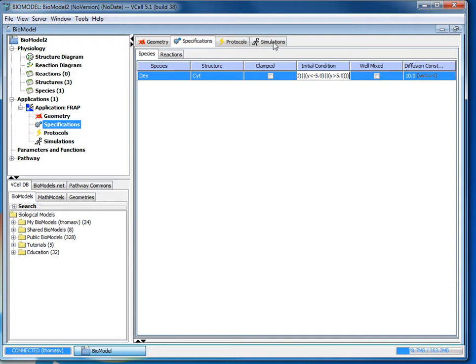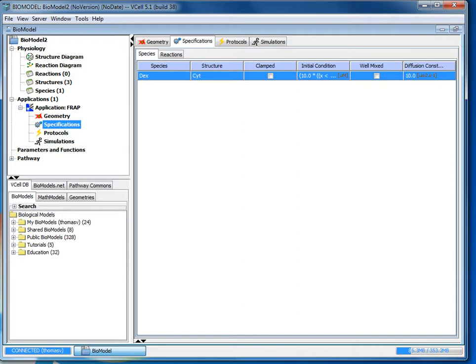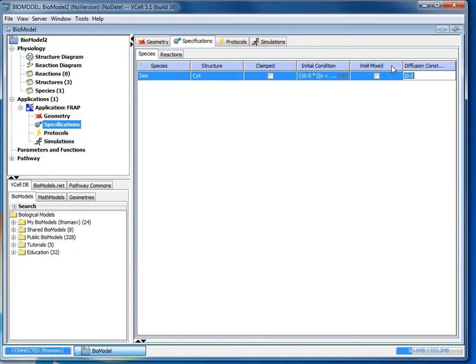And then three closed parentheses. If you don't want to enter this in yourself we will copy this expression and put it into the description box so you can copy and paste it into the initial conditions. Then you'll press enter to finalize it. What this expression does is it defines the location x and y coordinates where the initial condition of dex is 10, and where the concentration is not set to 10 the concentration is zero. This is where the bleach region is and we're able to do this in a single boolean statement. After we've done that we've changed the diffusion constant from the default of 10 to 20.